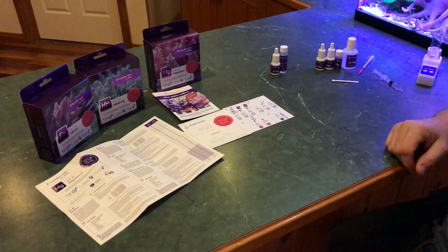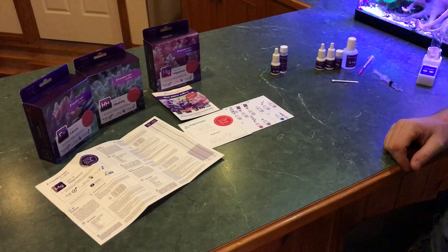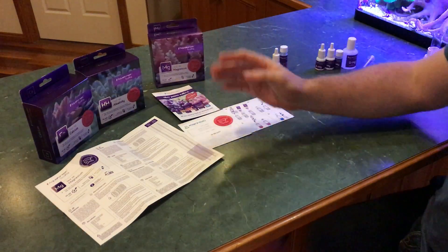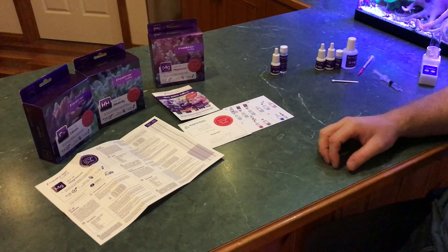All right, here we are. I've managed to pick up three of the new Aqua Forest test kits and thought I'd do a quick video. First time I'm using the magnesium one. Everything you can see in front of the table here comes in the kit, apart from the speed stir from Taylor.